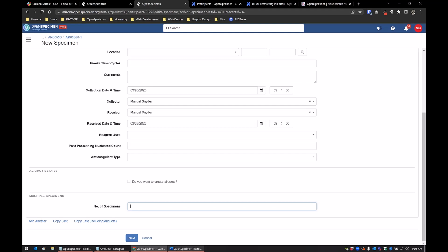So yeah, you would need to get whatever data out, or if you need to look at screens, things like that, take screenshots. You would need to do that before Thursday. I will have access to the database. So if you need a database export because you want to see all the data, I can send that to you.